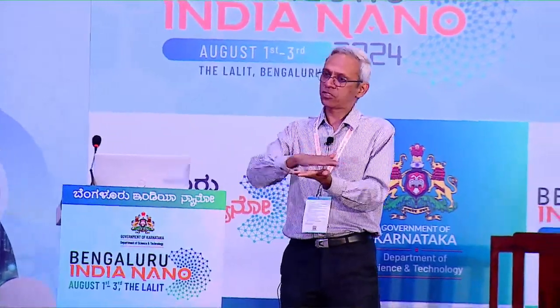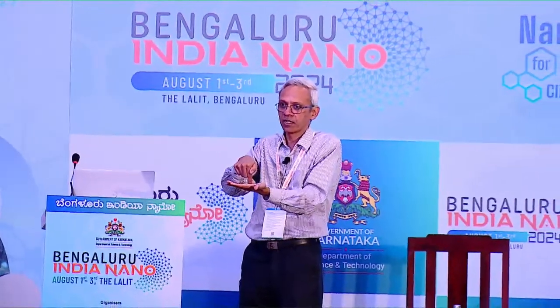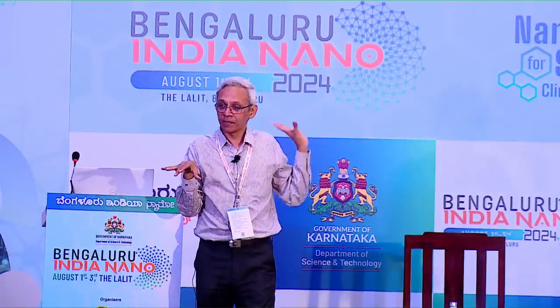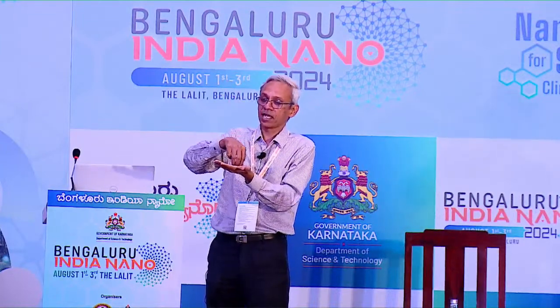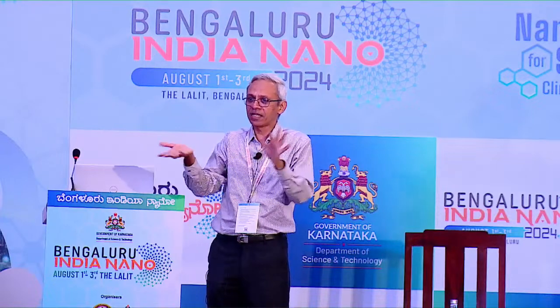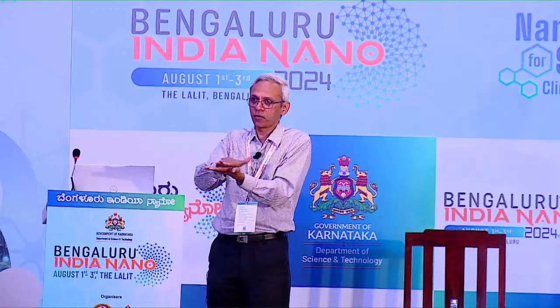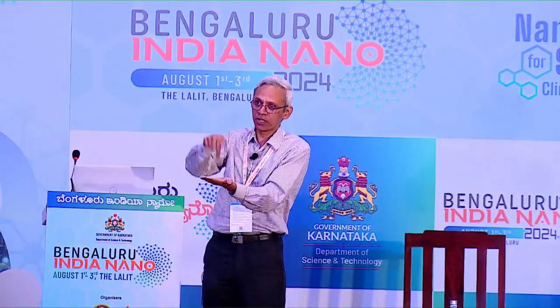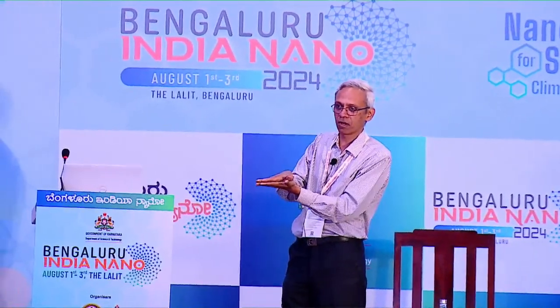By default in TEM, when you have a 2D material, it's always lying with the basal plane or whatever it is along that, and you're looking perpendicular to that. I'm not sure I understood your question properly. The advantage with the TEM, the diffraction in particular, not for 2D, generally, is that we can actually tilt and then get diffraction patterns along different orientations. For 2D material, the question doesn't arise because it's, for example, a single layer or few layers with a specific orientation that forms lying flat, always. You're only looking along that particular orientation. So in 2D, there's always this specific orientation, right? There's no other way the sample can fall.